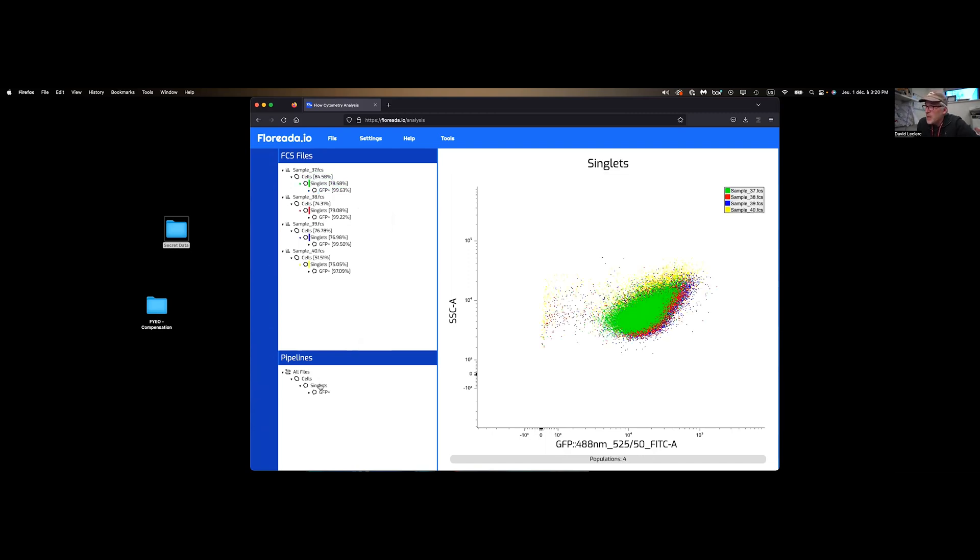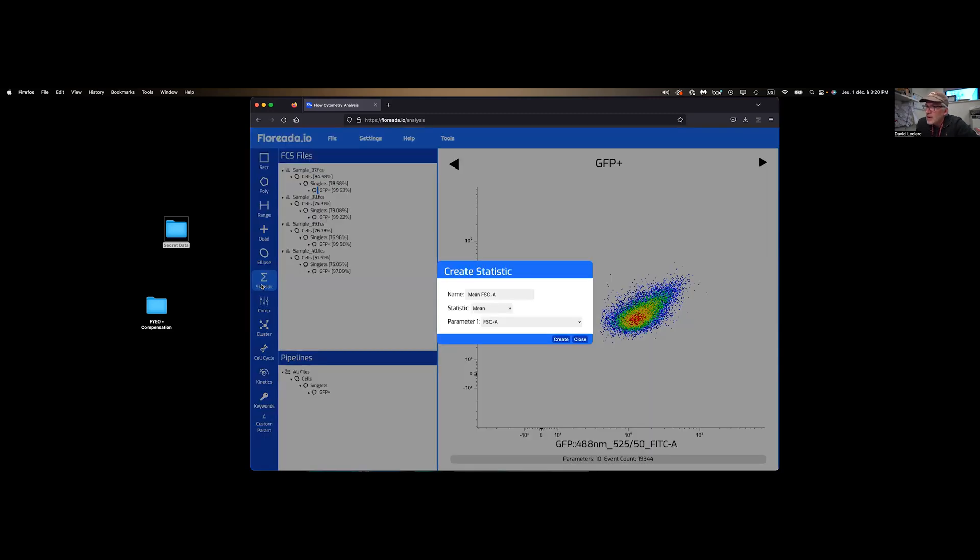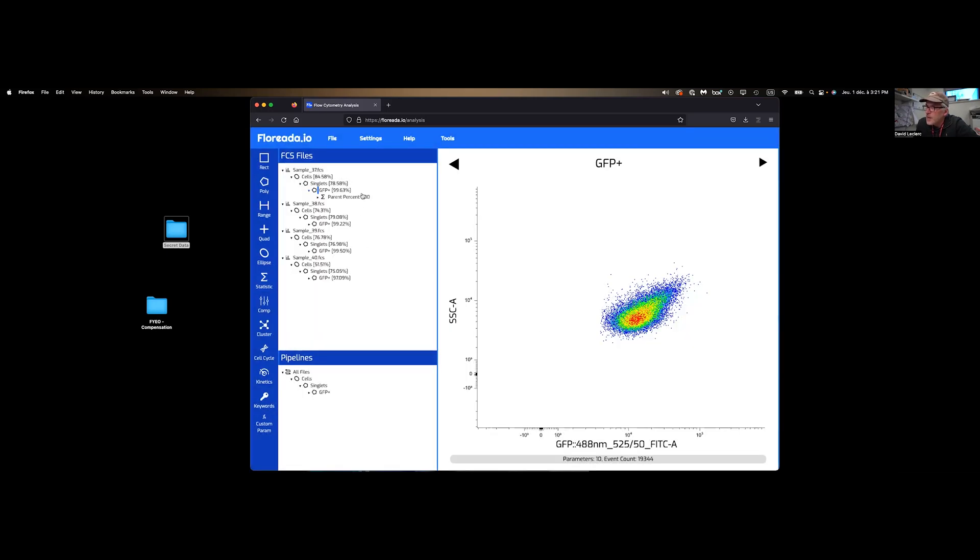And now my analysis is more or less done. The last thing I want to do is add a statistic. And so, for example, in this case, we want the percentage of the parent gate. And we're going to apply that to all my samples as well. So I'll explain why I need that.